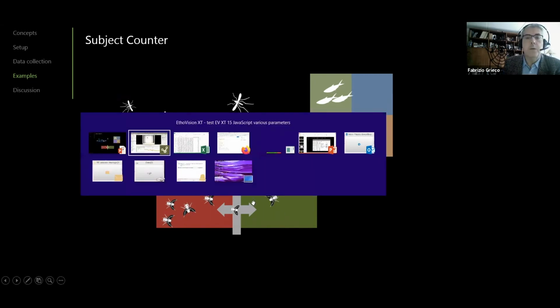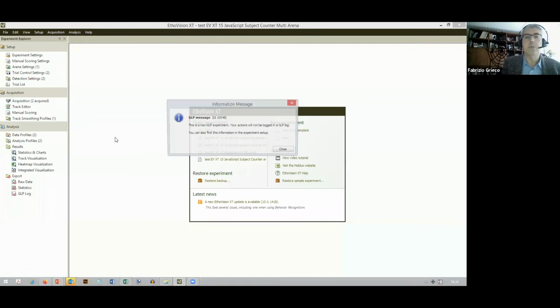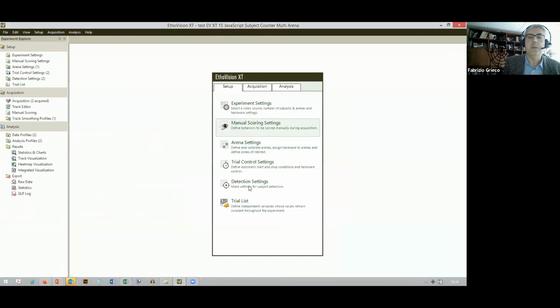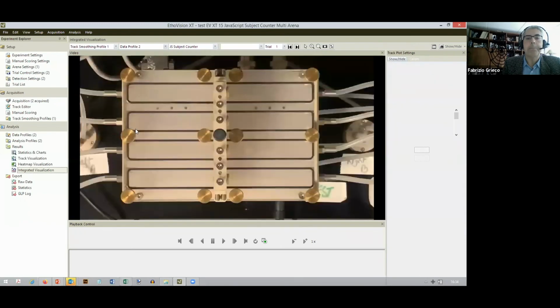Again, I'm going to open this experiment in EthoVision. We have a new video with the Drosophila, which was kindly provided by Yazid Rashad, Georg August University, Göttingen in Germany. So we are going to look at this video. It will take some time to load the data, because all these charts are made for each subject, and there are a lot of subjects in this video.